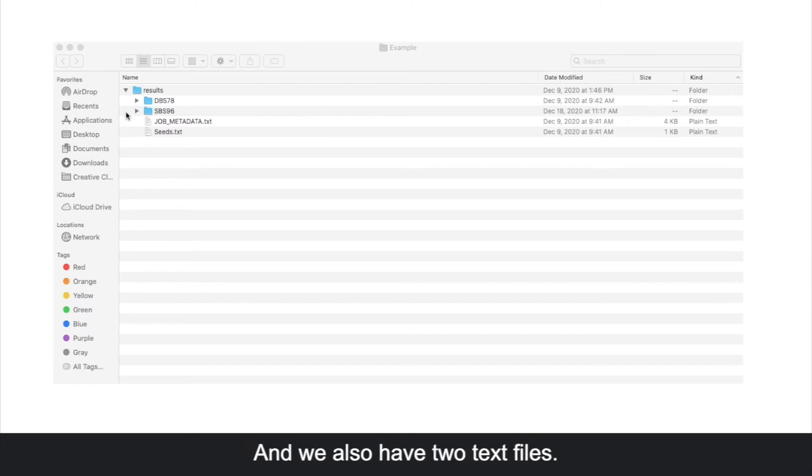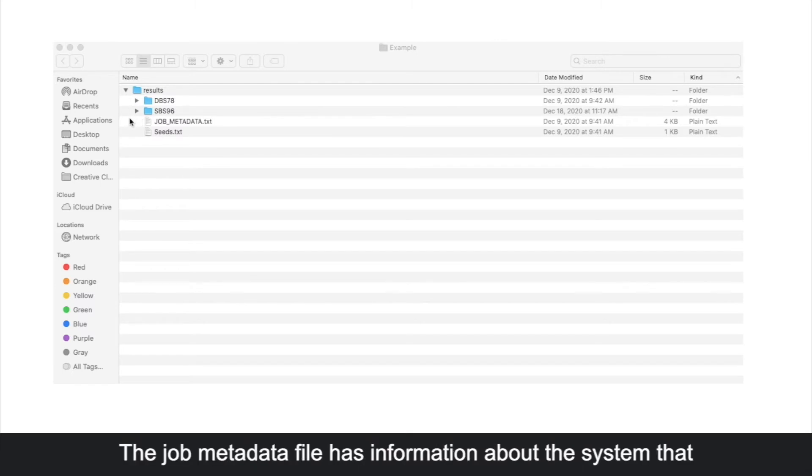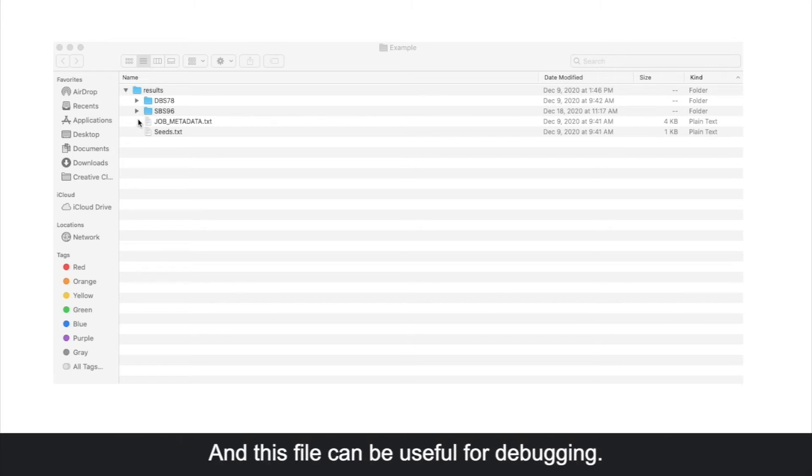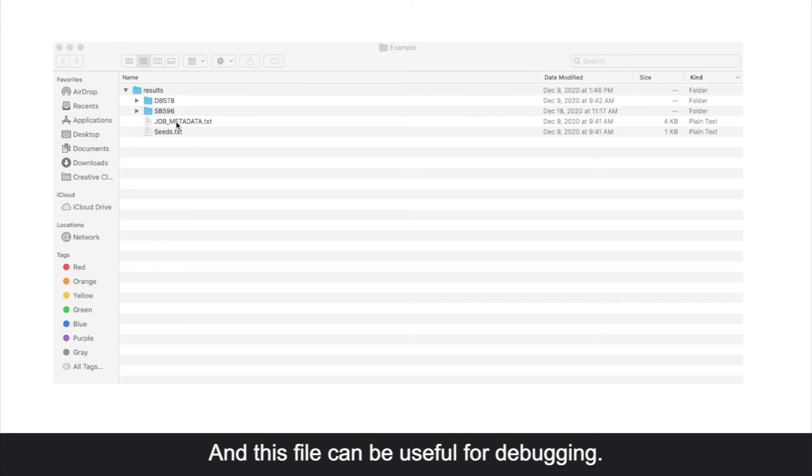We also have two text files. The job metadata file has information about the system that we ran the program on, as well as the different input parameters that were passed, and this file can be useful for debugging.